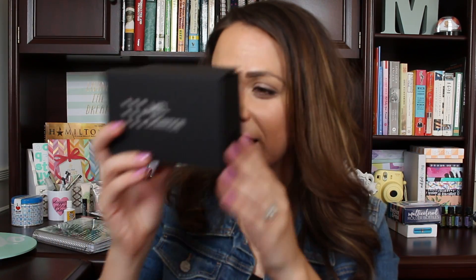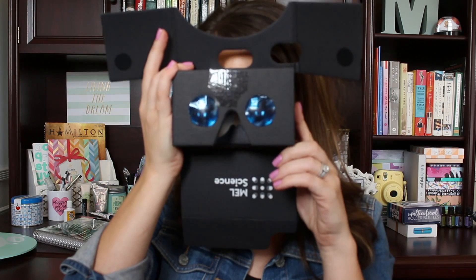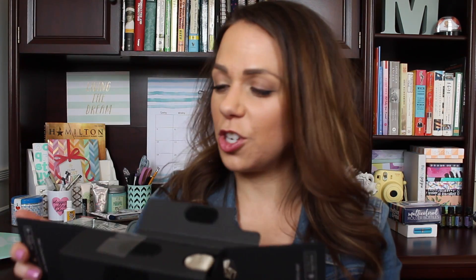The first thing you get in this box — let's see — these are like cardboard headset goggle things. Oh, it actually has velcro on it! And there are little instructions right here that tell you how to do it — you can look through it like this. It's just so well designed and interesting. I'll find out later what this goes with.